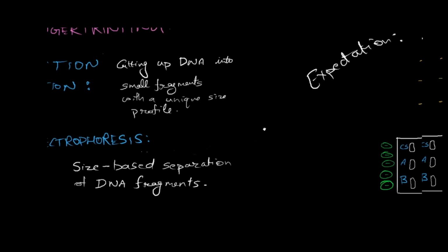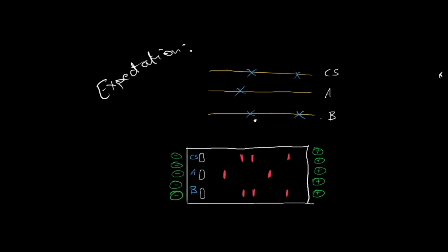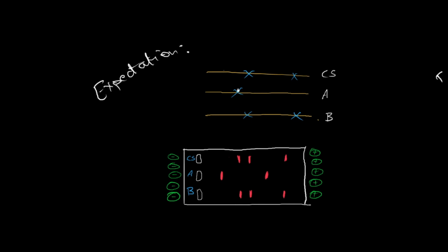Okay. Now, we talked about how our general strategy, our ideal strategy, looks something like this. This is what we want it to look like, where we have these clean breaks because of the restriction enzyme that cause these neat little bands, and you can see here that there is almost like a barcode-like pattern that can serve as a unique identifier for the person.